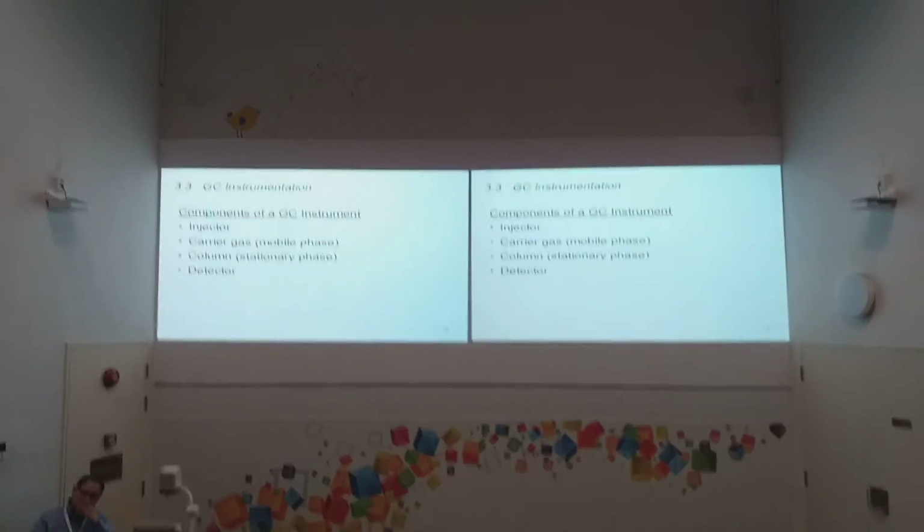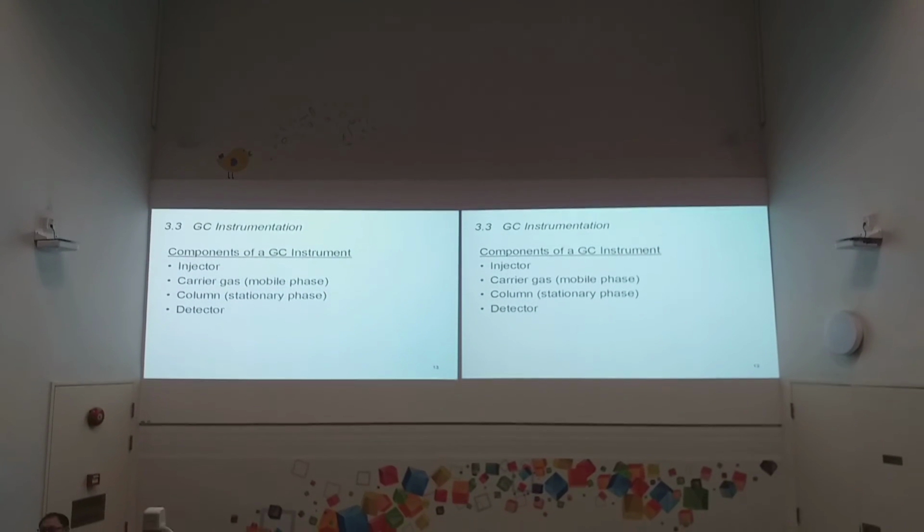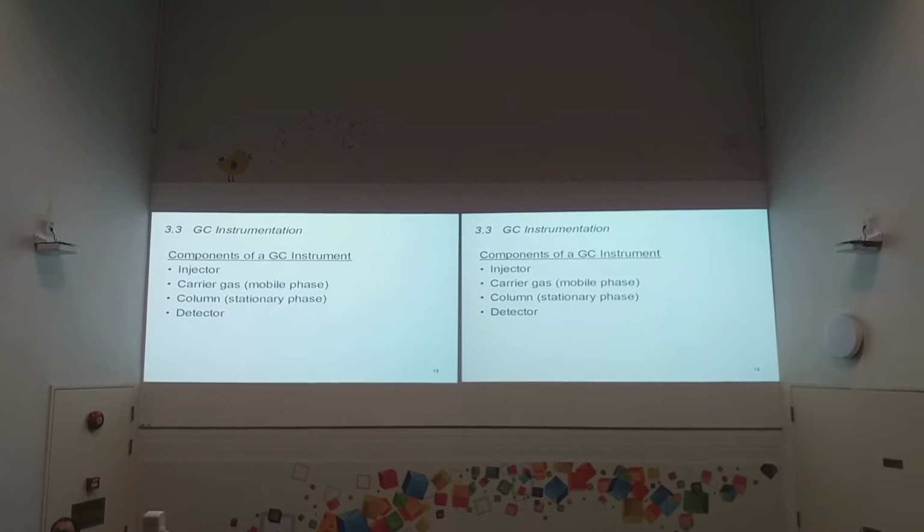To put in the gas. The solid or the liquid one to vaporize. Okay, so now you recall the right way. Actually, a more scientific way is we have a task, right? We go to study some products. So actually, it's for you. The injector fundamentally is for you to introduce the sample, right? The product, maybe it is a Coca-Cola, maybe it is a Panadol tablet, right? So it's for you to introduce the sample into the instrument.